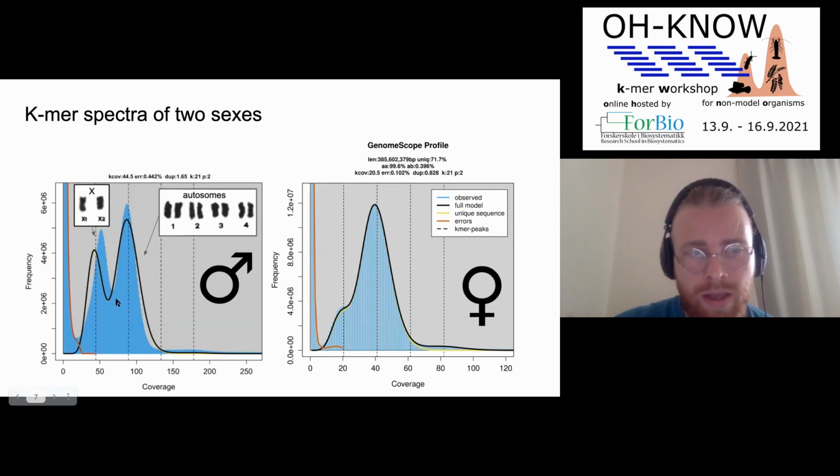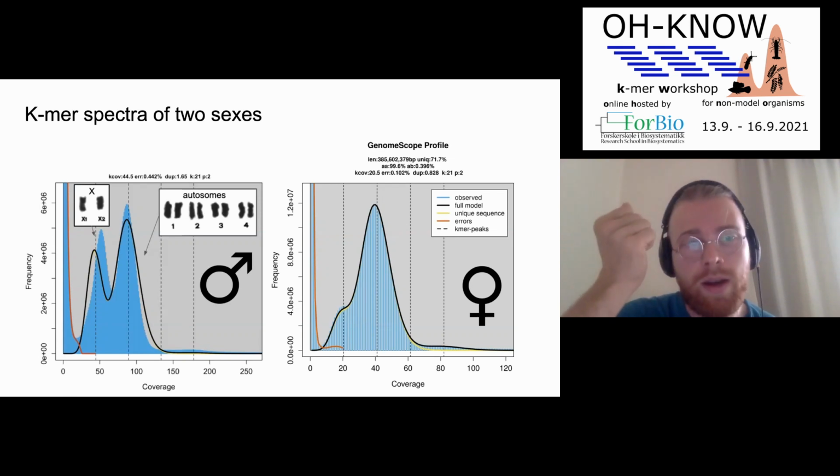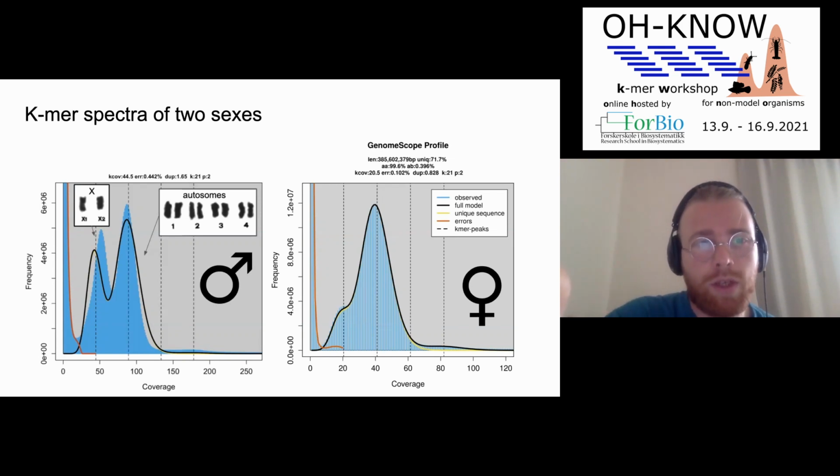unevenly spaced peaks. So this is the first and strongest evidence for having a library of mixed tissues of different karyotypes, that the peaks are unevenly spaced. It was the same case when Lucia was showing you when she had two different plants in there. Again, she mixed two different tissues with different karyotypes, and what she ended up with are unevenly spaced peaks.